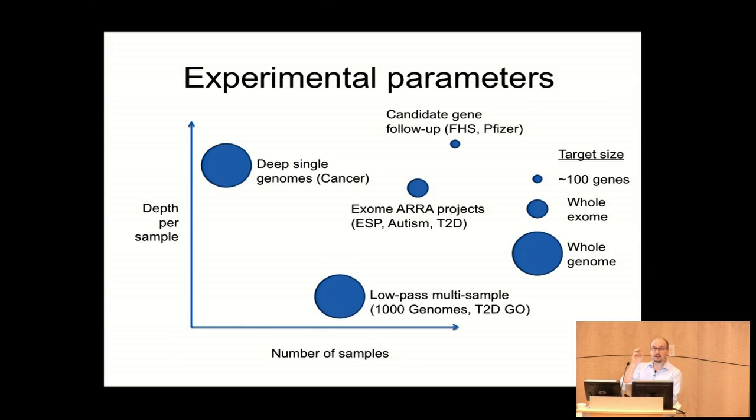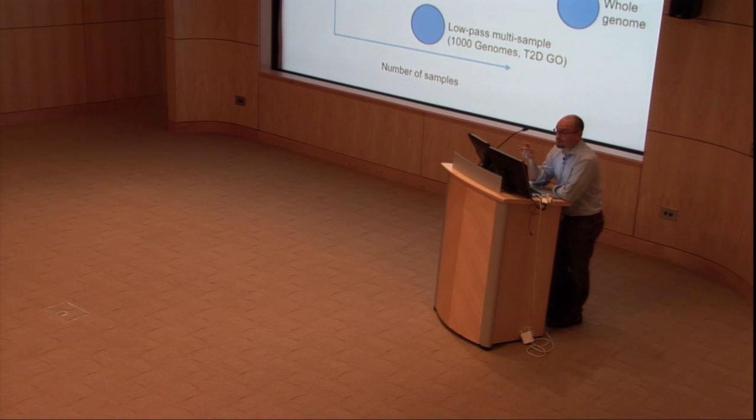So you think about it, you have a camera that's looking at a fluorescent image. And in order to have enough signal to see the fluorophores that are showing you which base is there, you have to either have an incredibly sophisticated camera that can observe single molecules, which is what you would get with a Helicos machine, or you would have to amplify the signal somehow by amplifying the molecule locally, and then you would get a homogeneous fluorescence image in the neighborhood of the cluster.